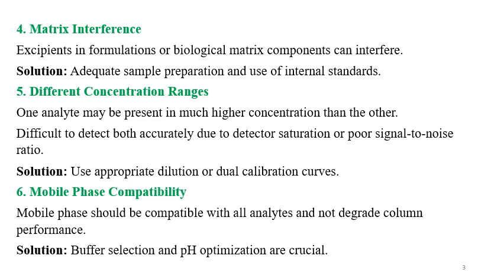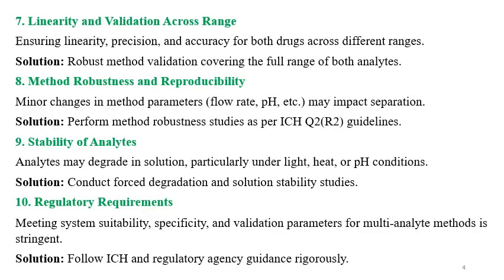Solution is use appropriate dilution or dual calibration curves. That means proper dilution to be selected, or you can go with different calibration curves for the different APIs. Sixth one is mobile phase compatibility. Mobile phase should be compatible with all analytes and it should not degrade the column performance. Solution is buffer selection and pH optimization for the compatibility problem.